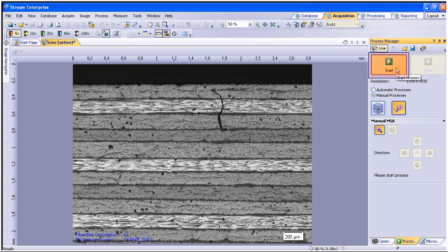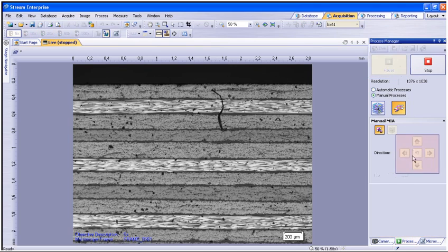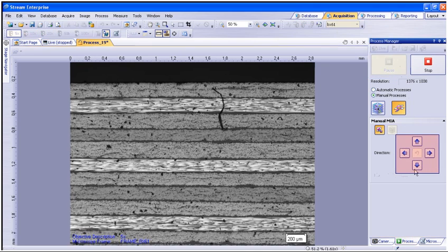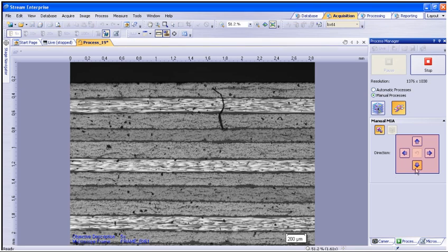Once the process has started, you will notice the direction arrows will activate. The arrows will define the stage scan path for the stitched image.